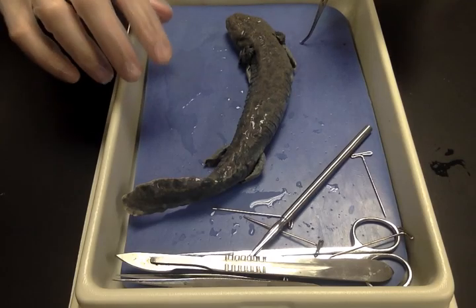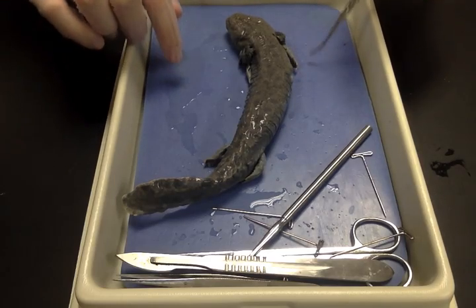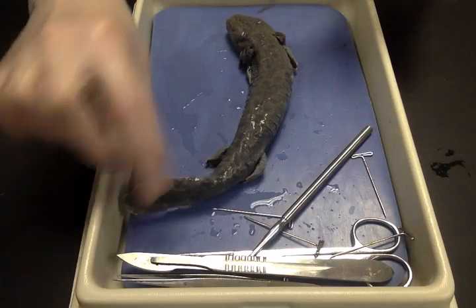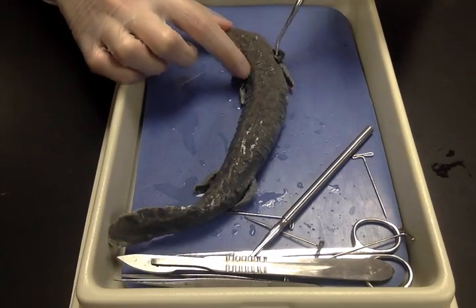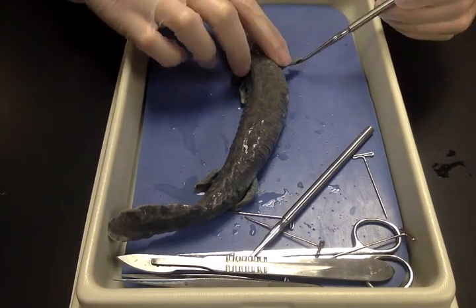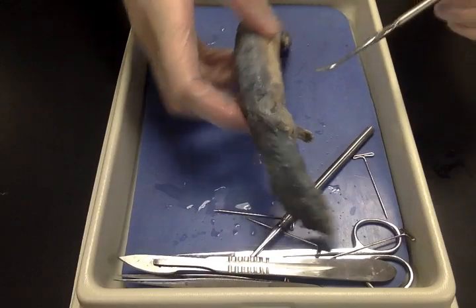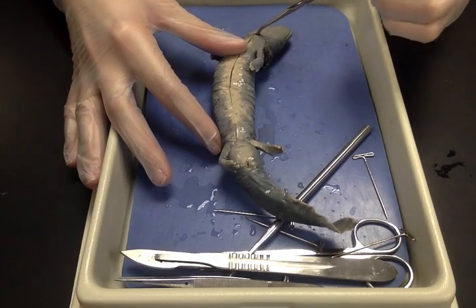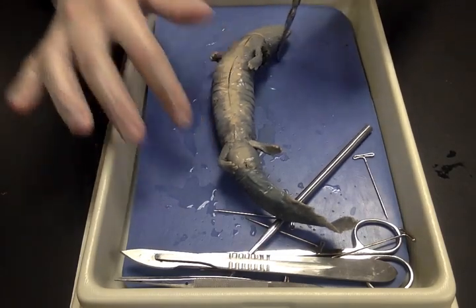This is a mud puppy and we're going to go through the features of it for the dissection test. External anatomy: it's covered in skin, this is the tail, and this is the head. On the head you can see the eyes covered with the nictitating membrane, here are the external gills, and it has four small appendages. On the ventral side, here's the cloaca.